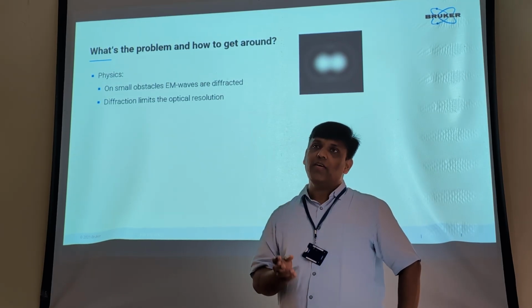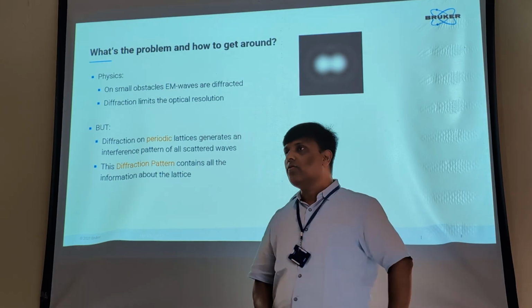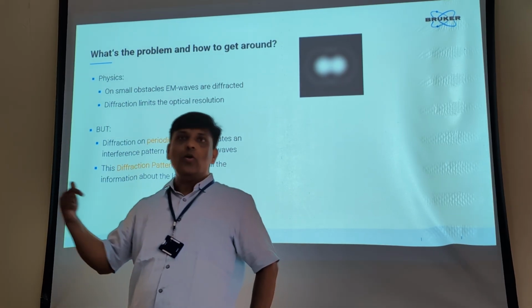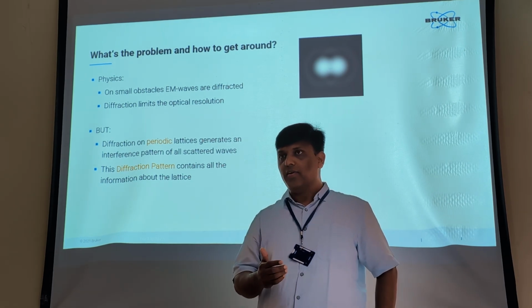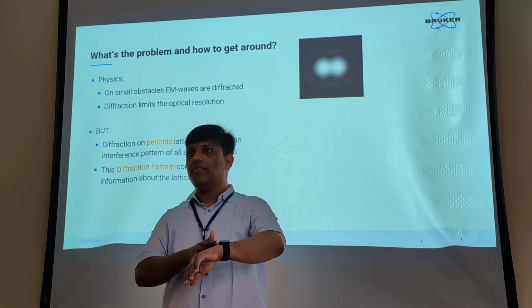So that's the same thing we use here in X-ray diffraction, where the radiation for the diffraction experiment is the X-ray. We know that when we shine an X-ray on a crystal, so what is a crystal? It contains periodic, repetitive atomic units.